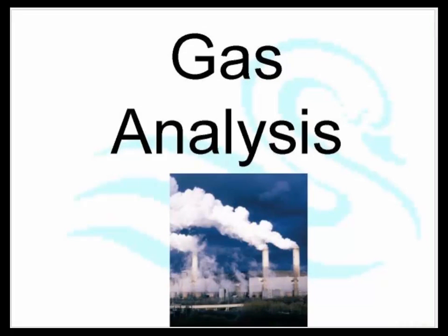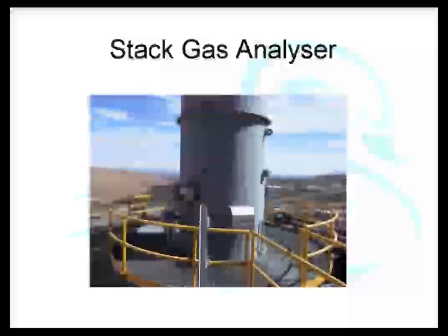Now we're going to look at some other things, gas analysis. Gas analysis is very important to us nowadays because of all the pollution that has occurred in the past. So we're going to analyze gases. We're going to analyze gases coming out of chimneys, and we're going to analyze gases just sitting around in rooms.